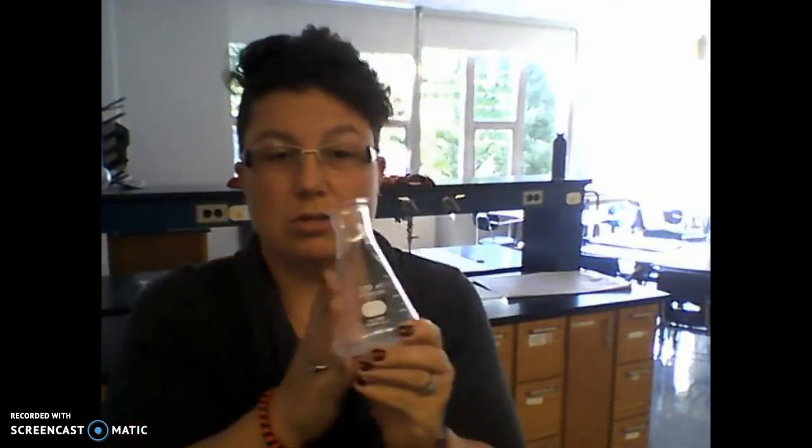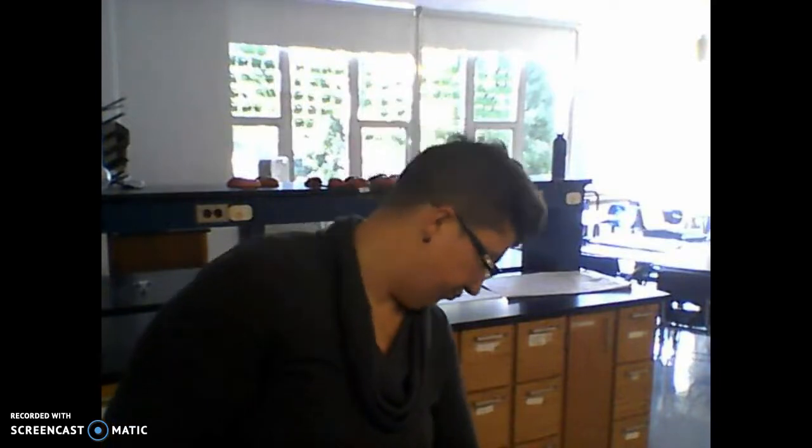You have your Erlenmeyer flask — spelled E-R-L-E-N-M-E-Y-E-R. On the side it says 250 milliliters, but notice there's no 250 line; it goes to 200 milliliters. Like the beaker, it's meant for stirring and heating up. It's not super accurate for measuring — approximate measurement is okay, but we'd rather use the graduated cylinder whenever we have to measure liquids.